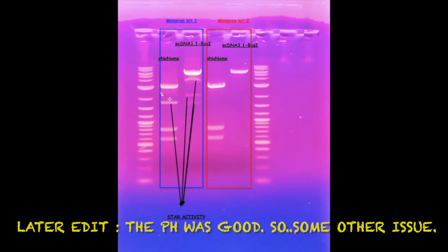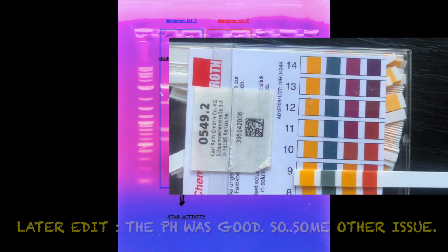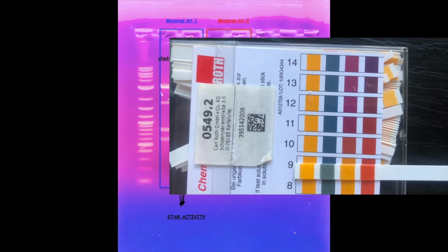This is really helpful for me, and I'm glad, because this means that my plasmids got assembled correctly. I have in my bacteria the plasmids I want, but sadly, there is probably something wrong with the elution buffer in this kit. Maybe the pH is not right. Too high or too low pH can contribute to star activity. Maybe I have some kind of contamination. I have no idea.